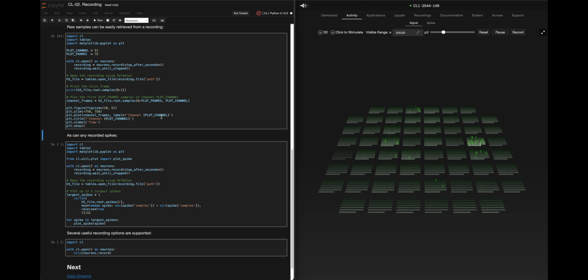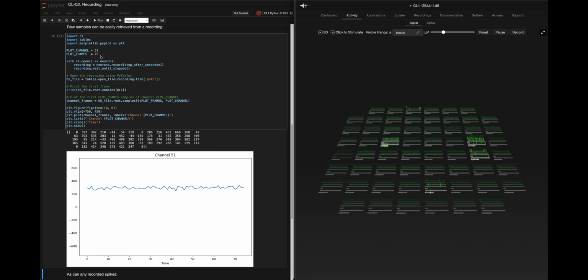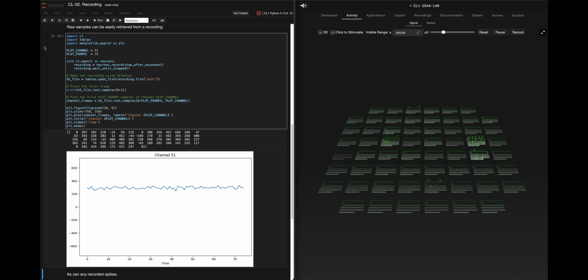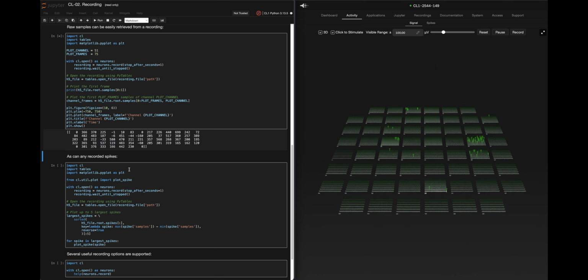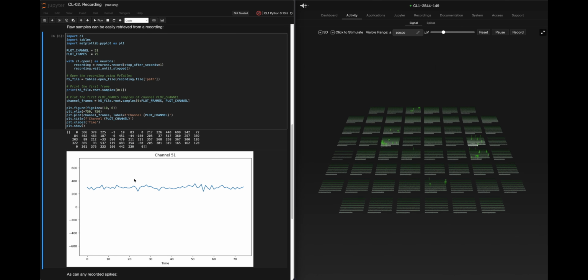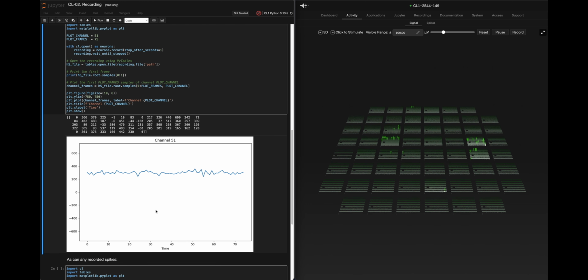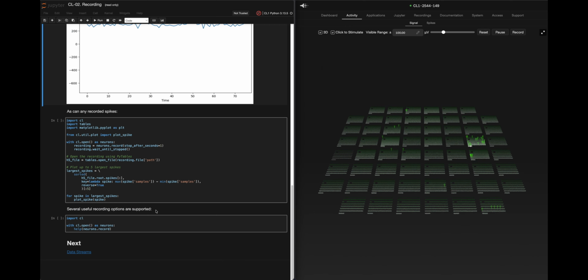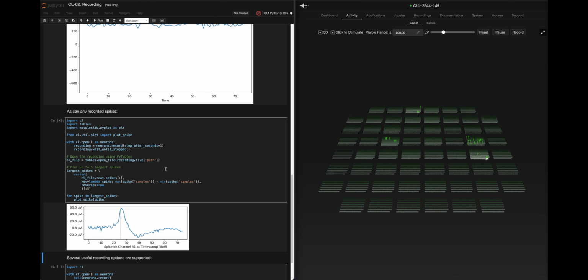We're going to just run the code, run in blocks of code here. Let's see, channel 51, and we'll just run it one more time because I'm trying to get some more visibility on here. But yeah, you could see, I think we're doing, yeah, it might be a good one on the next one to do. So we'll come down here on this next one even. We'll just run these two because I just want to kind of explore it.